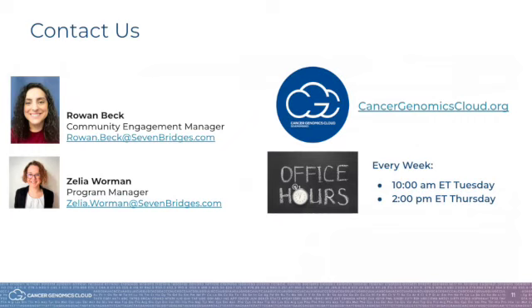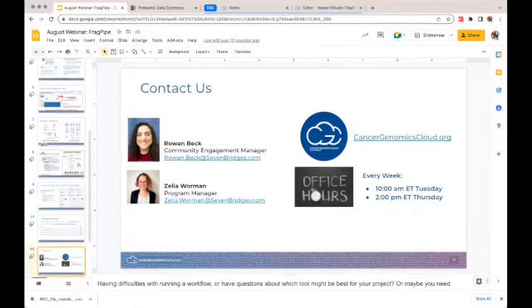Okay, so I am going to switch over from my slide deck onto the CGC platform. Give me just a moment to do that.